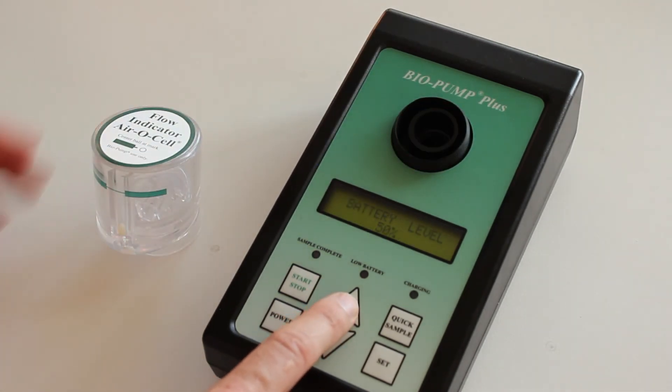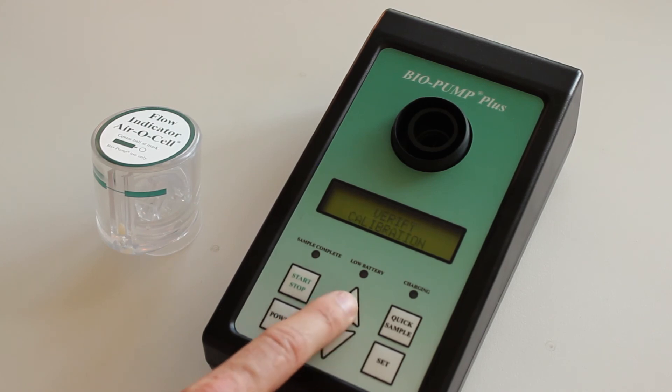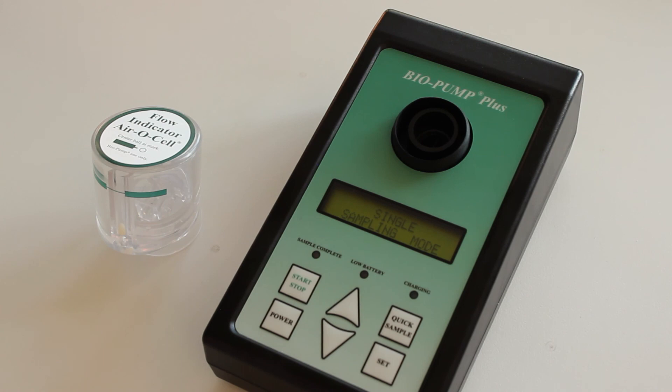How do you do this? Up, battery, single, sequential, and then you're back at calibrate. So they're the different modes. You can go quick sample or set depending on what time you'd like.